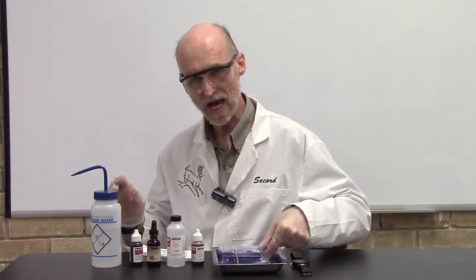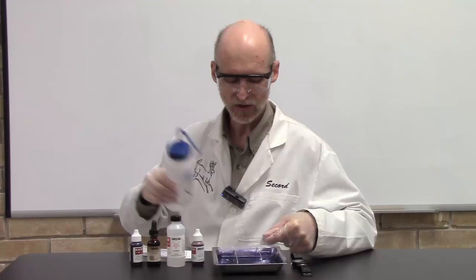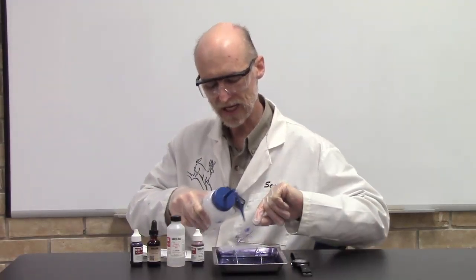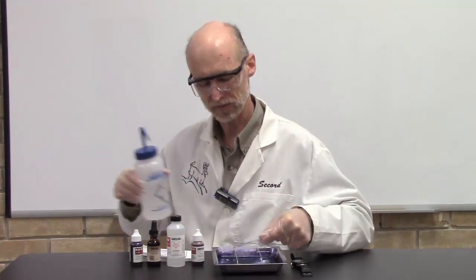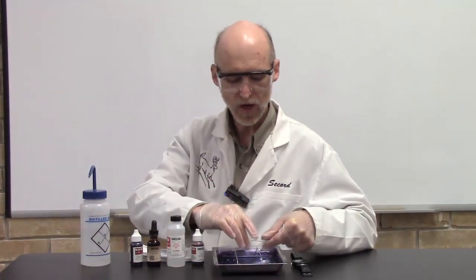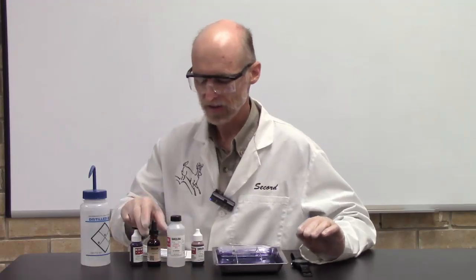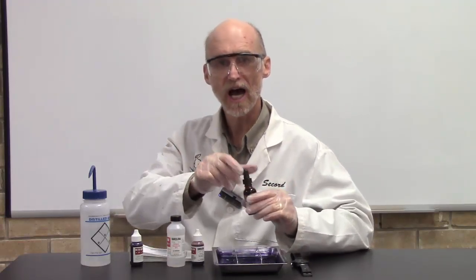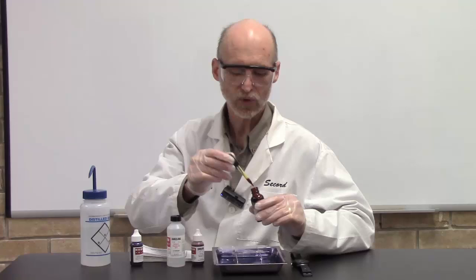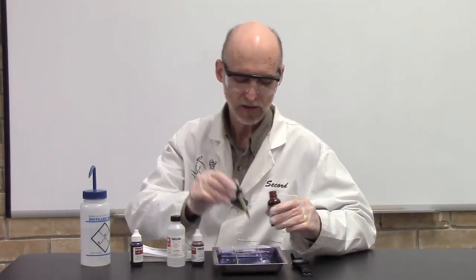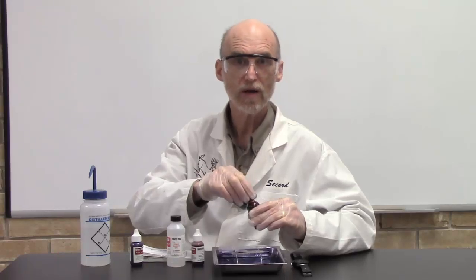After one minute has passed, you rinse the crystal violet off and I always rinse both sides of the slide to make sure I get it all off. Now leave the water on, don't worry about blotting dry. You don't blot between steps—you only blot when you're completely done with the whole technique. I immediately move on to my iodine and apply a couple drops on top of the bacterial smear. I'll let that sit one minute also.